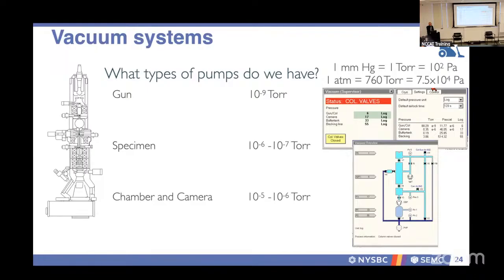When you have the data collection practical a little bit later, you can ask your operator about the different menus and the different vacuum systems, and you can see the array of that. And when you get to the microscope in particular, you can see how it's all laid out. One advantage is that, yes, we're going to go over this in theory, but later in the afternoon when you see an electron microscope, you can dig in. Given that we don't have any users, you can ask your operators to poke in, or we can open up the enclosures. We actually have one Krios microscope under maintenance, so you can see all the vacuum systems in person. And you can see the space it takes up and what's required to achieve some of these values.